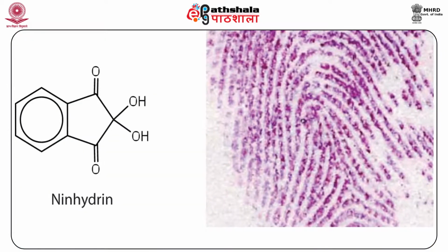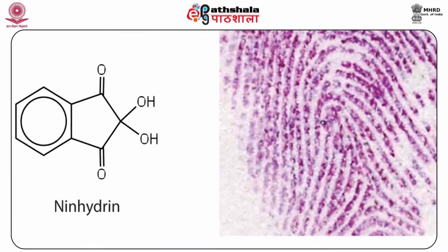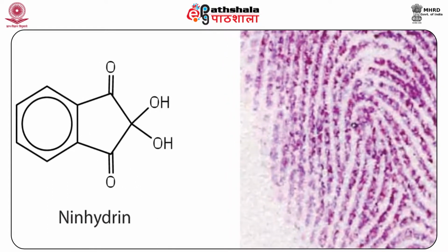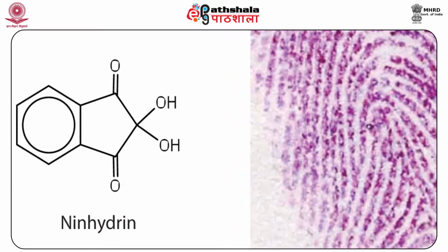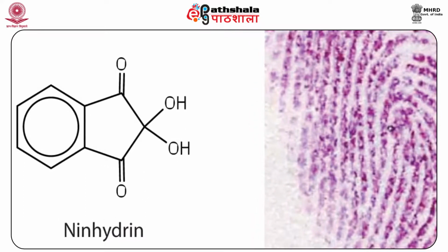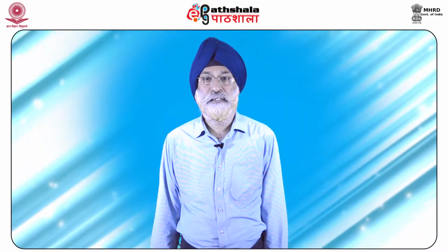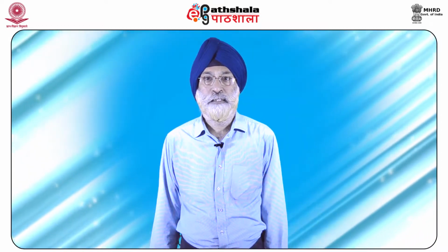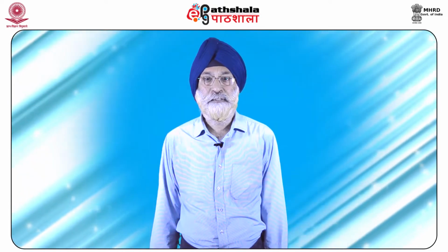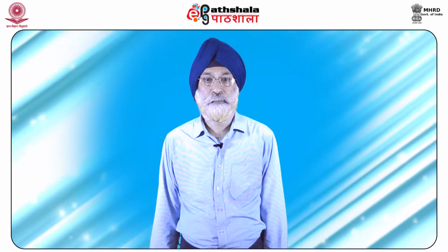The most useful reaction of Ninhydrin is with amino acids. A purple colored compound is formed as a result of this reaction. The product has come to be known as Ruhemann's purple, or in short RP. The amino acid Ninhydrin reaction has proved to be useful in several analytical procedures. Incidentally, this very reaction makes Ninhydrin a reagent for fingerprint development.